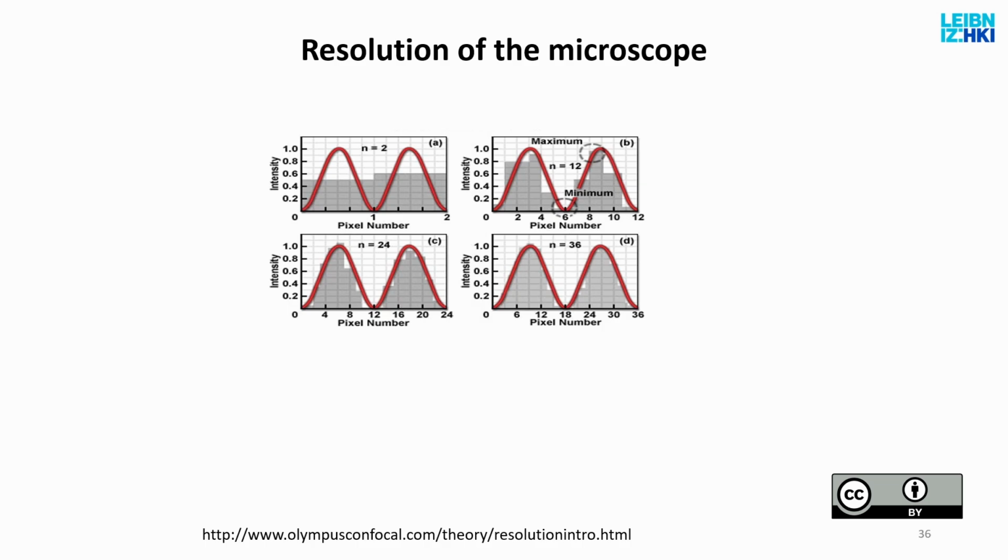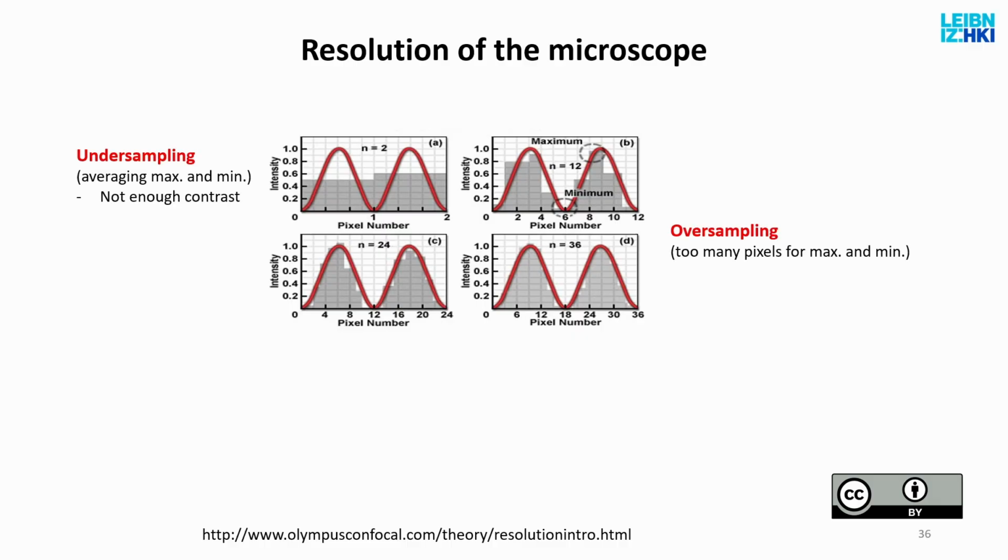But in order to collect such small pixels, you may need to oversample your data, which means that eventually you will, for example, illuminate the sample too long, and you simply will kill your cells. It could be photo damage, you could be bleaching your photo dye, and so on and so forth. And it might take much longer. So there is an optimal setting for this one.